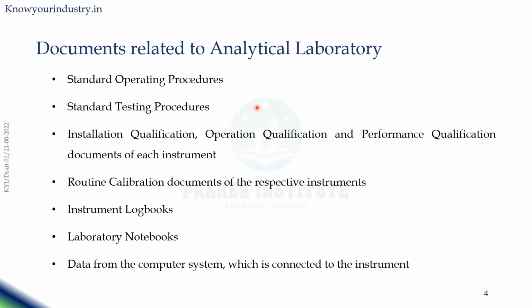Another example, while entering into the laboratory, what are the procedures you need to follow? What are the protective equipments you have to wear and how to wear? All those things are also captured in the standard operating procedure. And how to handle an instrument, how to do the weighing, how to wash a glassware. So all these activities are captured by standard operating procedures.